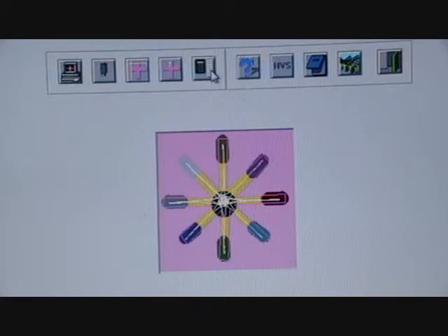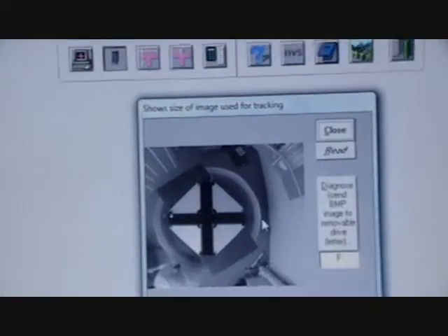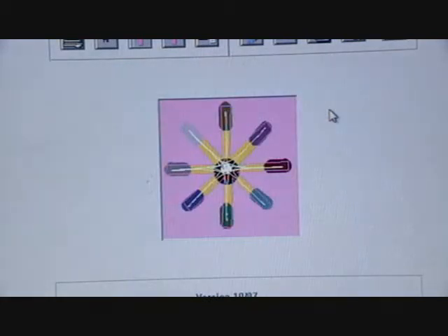And as I said, for the way in which we use this, it's really a setup for locomotor activity. So when we have a rat in here, we give a particular drug and we can see how much it's moving, and it's just much simpler to get the more objective data rather than sitting here writing it down. And obviously you can use the elevated plus maze, the anxiety maze, where the open arms are located versus the closed arms, and you can get measures of anxiety in that way. So it's a nice way to get some additional measures using the same system.